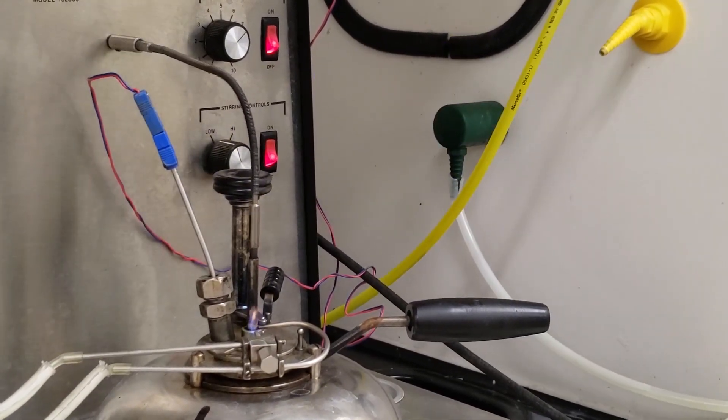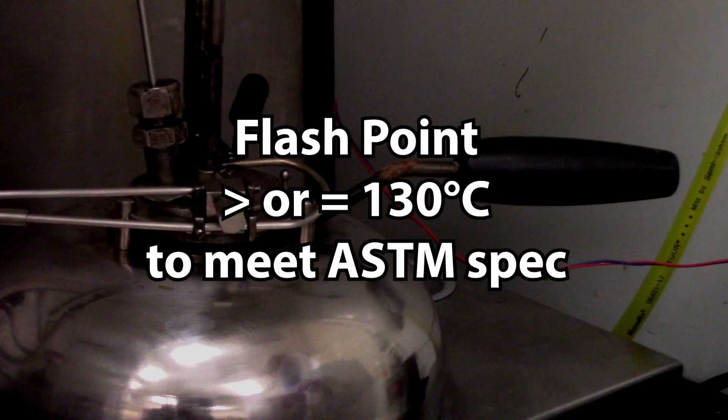When you're finished, be sure to turn everything off. The flashpoint must be at or above 130 degrees Celsius to meet the ASTM standard.